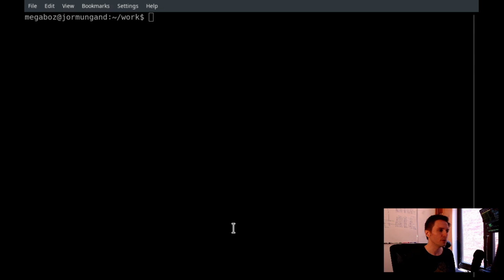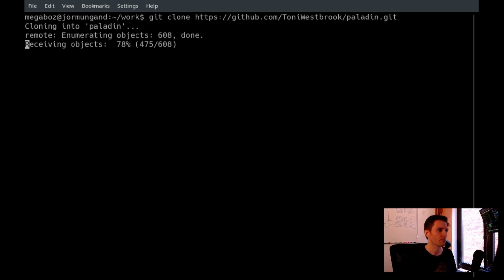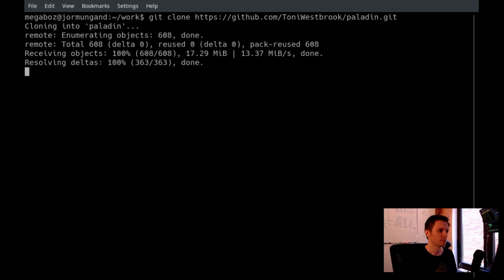So I'm going to include a link to my GitHub page in the YouTube description, so you can download from that. We're going to do a git clone command. That's what we're going to do to download from the Git repo. I'm going to put in the URL. Okay, so now the Paladin installer is downloaded, all the source code.